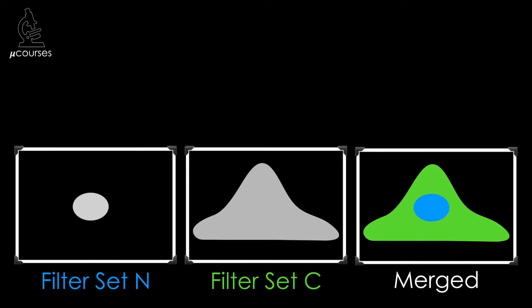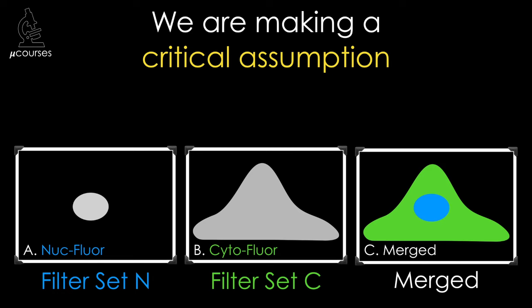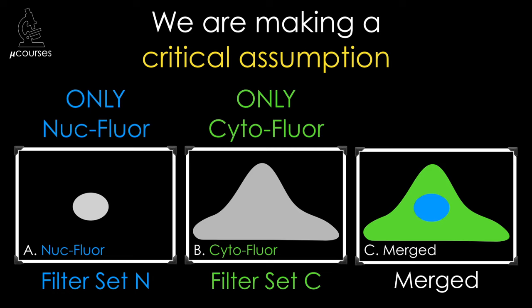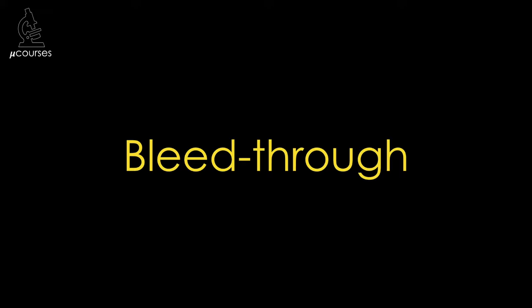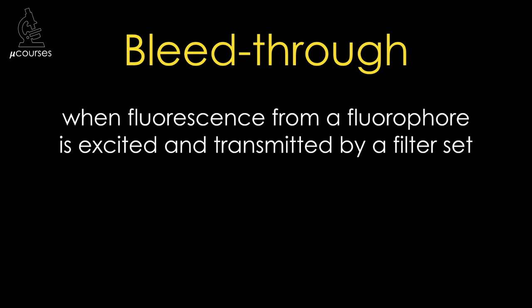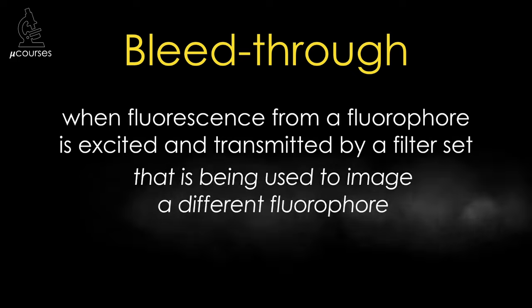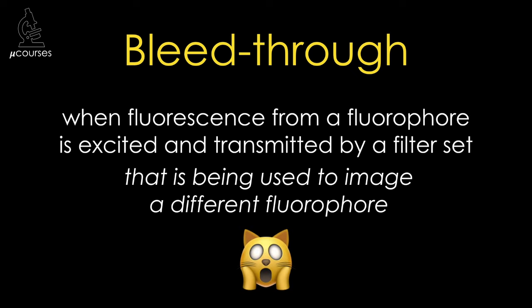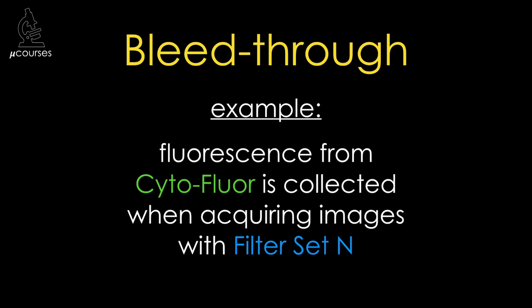It's very important to understand that if we collect images in this way and label our figures with the fluorophores that correspond to the filters we used, we are making a critical assumption that the images only contain signal from the fluorophores we intended to image. Unfortunately, this assumption is often incorrect because of bleed-through, also known as crosstalk. Bleed-through is when fluorescence from a fluorophore is excited and transmitted by a filter set that is being used to image a different fluorophore.